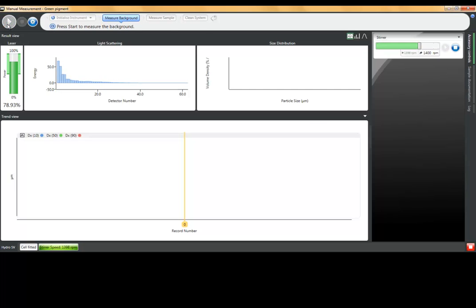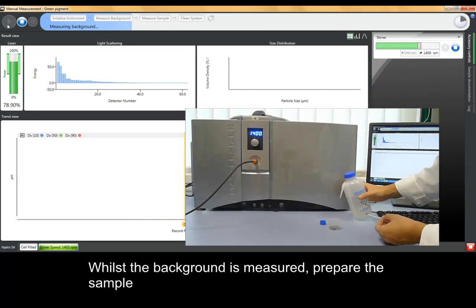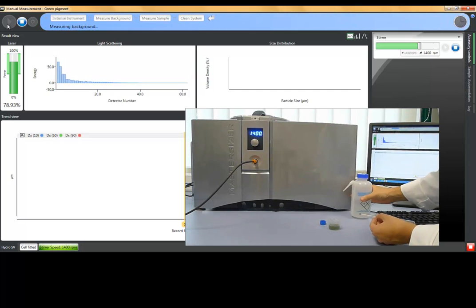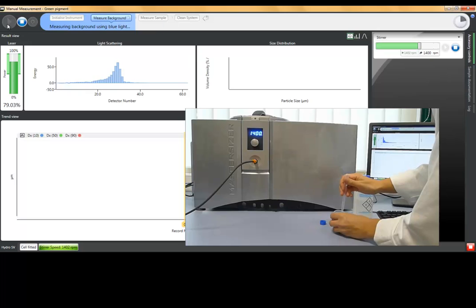We can then take the system through its alignment and background. And while the background has been measured, we can prepare the sample. Here the pigment has been dispersed with a little bit of surfactant and water.